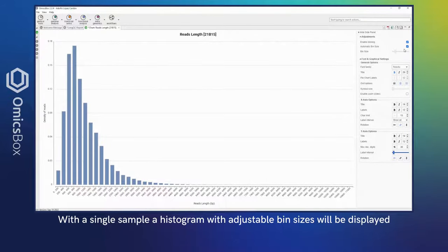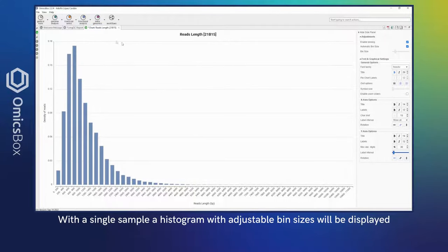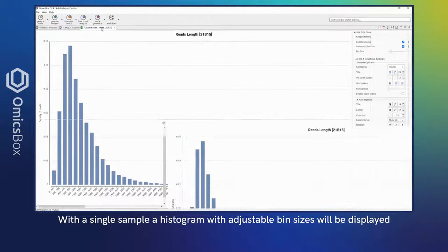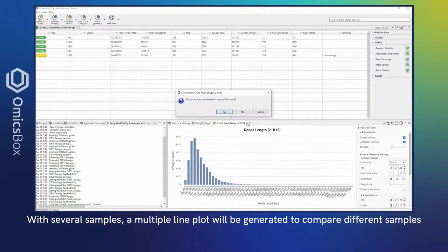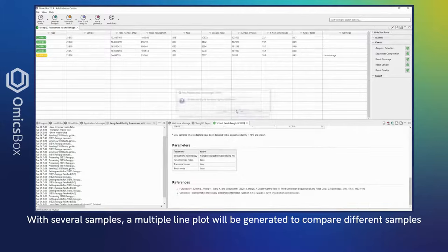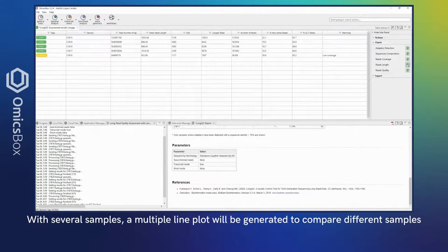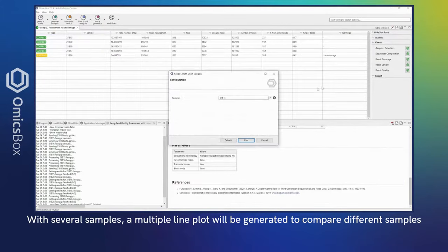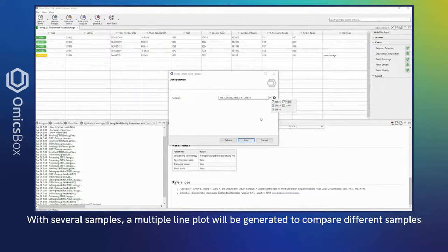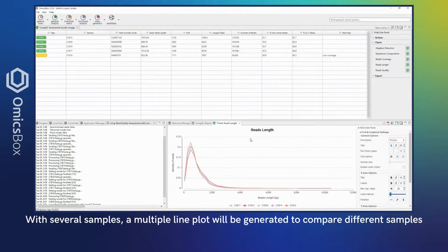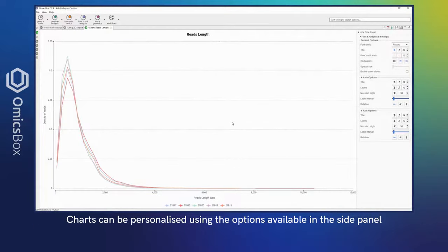With several samples, a multiple line plot will be generated to compare different samples. Charts can be personalized using the options available in the side panel. Available export options are PDF, PNG, or CSV.